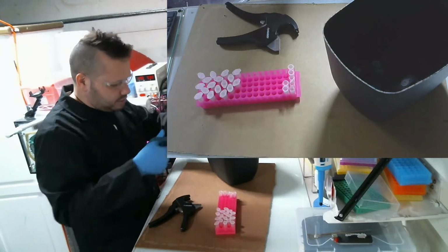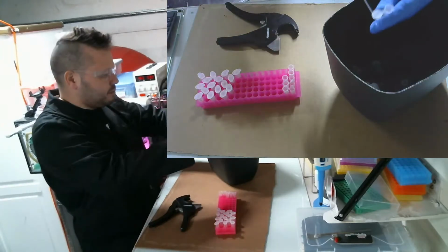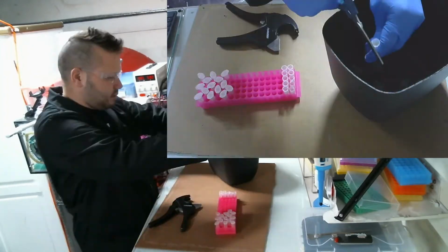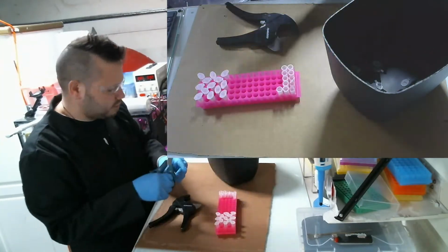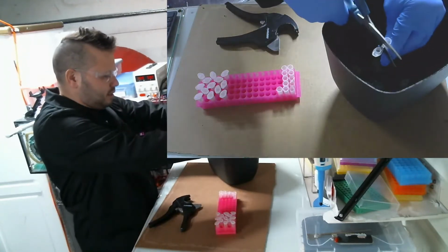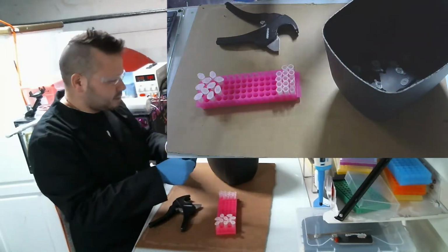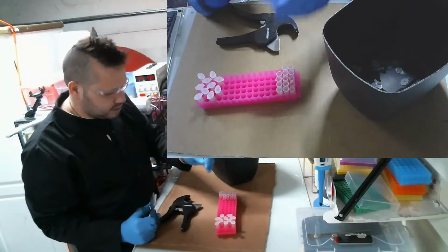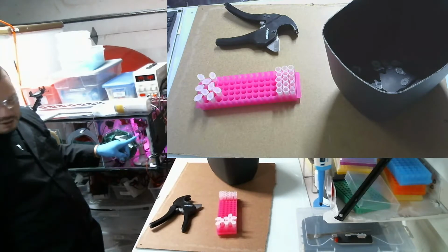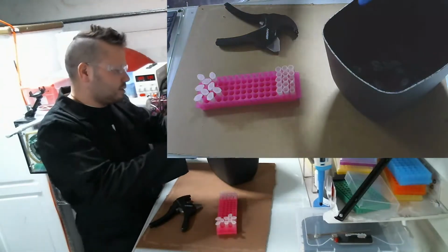And then I'm going to put it in the incubator, which is this thing in the back here. That incubator has a 24-hour grow light cycle, and it has temperature control. I can set it to, theoretically, whatever, but obviously there are limits. I have it set at 30 degrees Celsius, and it also has aeration access. I don't know if you can hear it, but there are air lines that go in there, and I can put up to 6 different samples in the incubator.